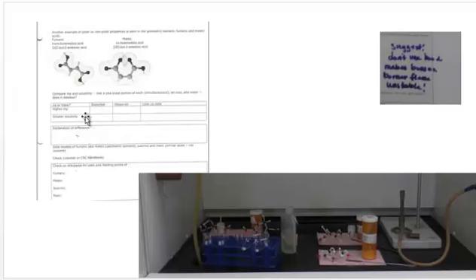In the second hood, you can investigate the properties of cis and trans isomers. We have fumaric acid and maleic acid, which are both diacids. So the difference in structure is the double bond, and are they across the double bond or on the same side of the double bond.